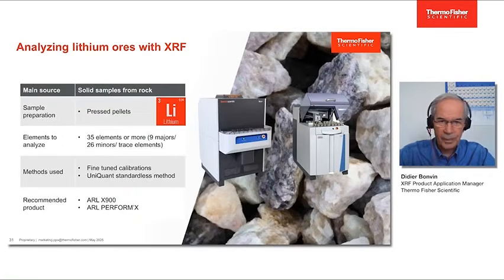If we move to the rocks, lithium rocks, then we are going to grind the samples and press the samples, and either an ARL X900 or an ARL Performix can do the job then to measure the various elements present in these lithium pegmatites, and either here again with fine-tuned calibration or with the UniQuant standardless method are able to do the job.